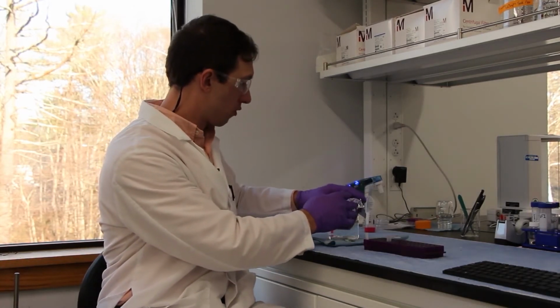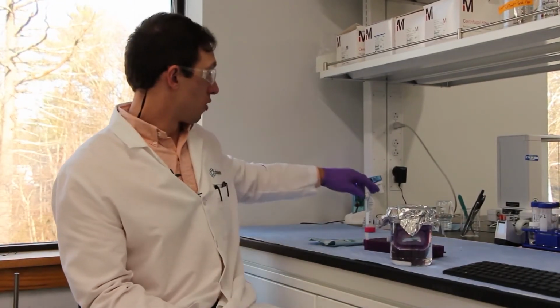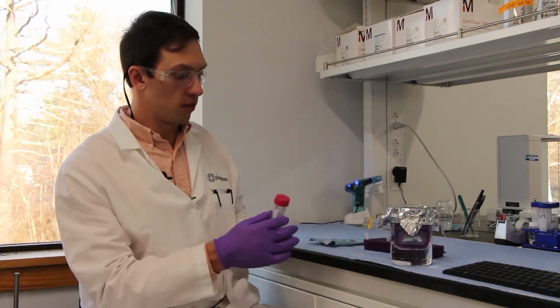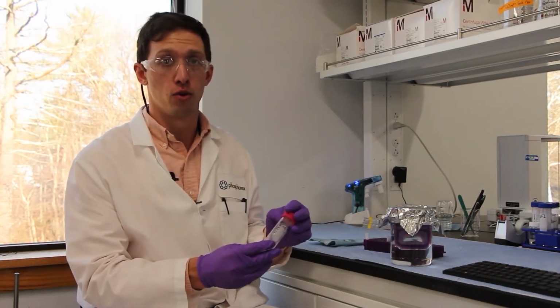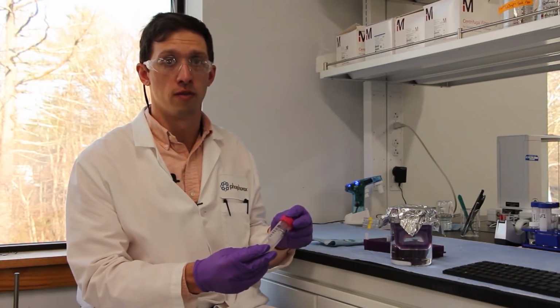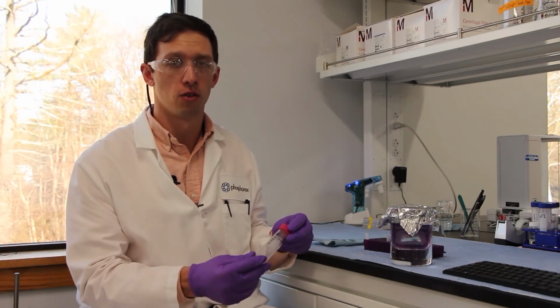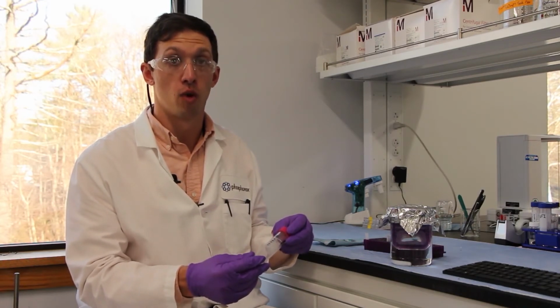We'll then cover this beaker, transfer this beaker onto a stir plate set at 4C, and we'll let dialysis take place overnight. The next day, we'll remove our sample from the fridge, transfer the sample that was once in the dialysis cassette into our Amicon centrifuge tube, and we'll use centrifugation to concentrate our sample down to a target volume, at which point we're now ready to remove an aliquot for DLS analysis and a second aliquot for RiboGreen analysis.